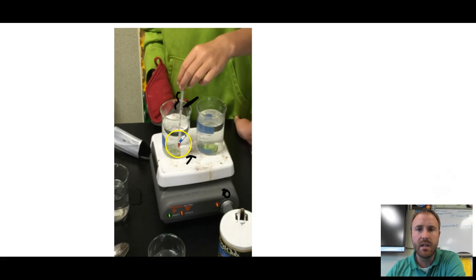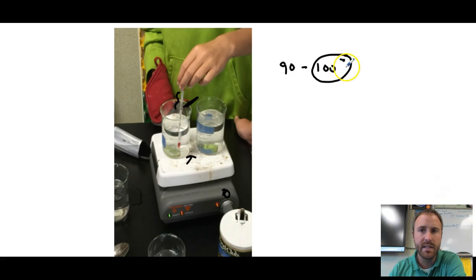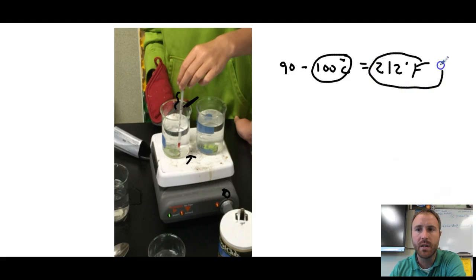And so most of you discovered that this type of boiling occurred somewhere between, your ranges were about 90 all the way up to 100 degrees Celsius. Now, what technically should have happened is it should have been right at or around 100 degrees Celsius. Make sure we're measuring in Celsius as well. 100 degrees is equal to 212 degrees Fahrenheit. Okay, these are two important numbers that you want to make sure you get used to working with. But it should have been close to 100 degrees Celsius.